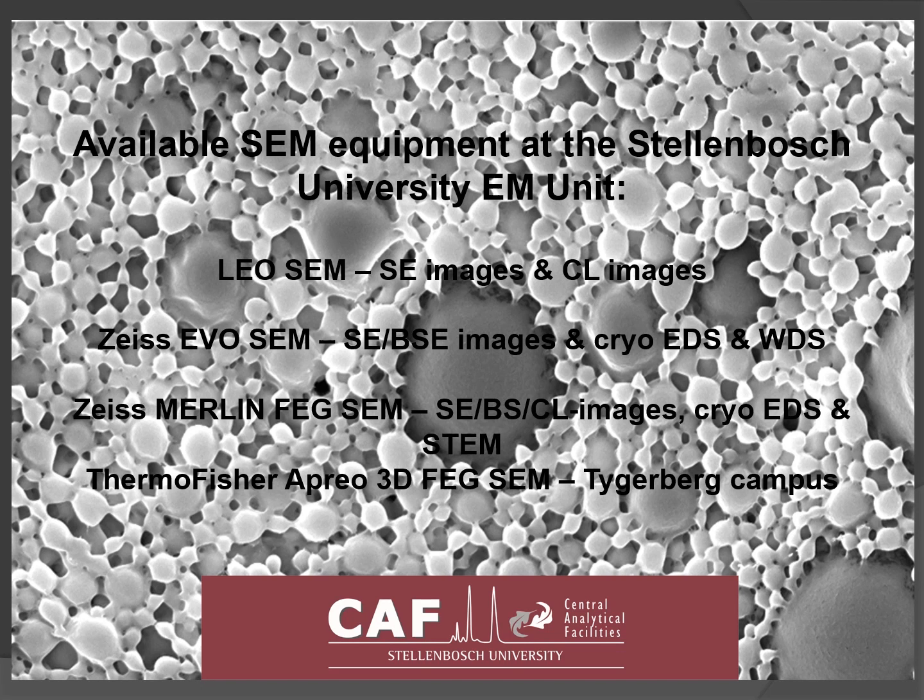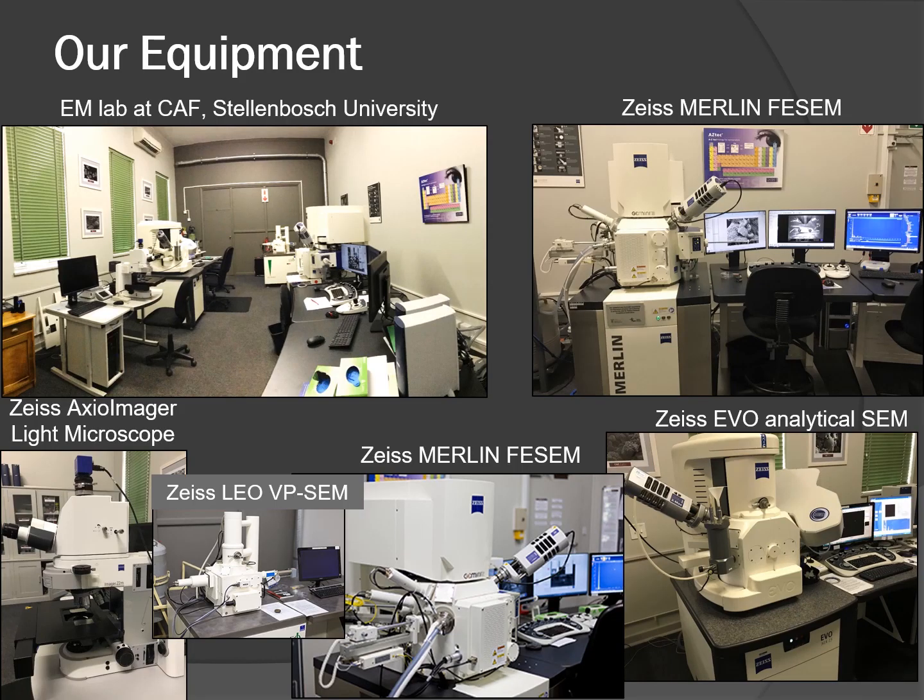On our Tygerberg campus, we have our Thermo Fisher Apreo 3D SEM. This is the equipment in our lab available at Stellenbosch University, together with the different instruments. We also have a light microscope and a Zeiss Axio Imager.